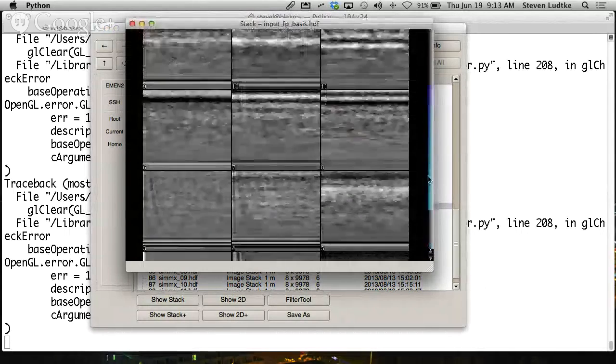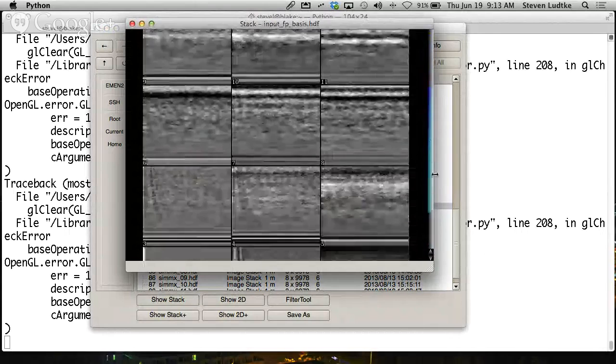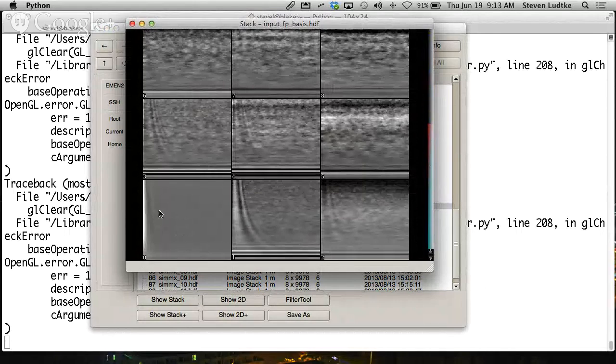It's basically looking at the changes that are present in the various images. So if I looked at those footprint images, this is the average of all the footprint images. And then this image represents the largest differences among the set of images. And the next image represents the largest differences among the set of images, discounting the differences that we've already taken into account, and then so on. So they become less and less significant as we go through the sequence.